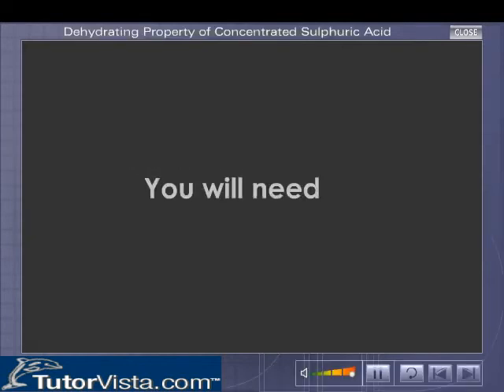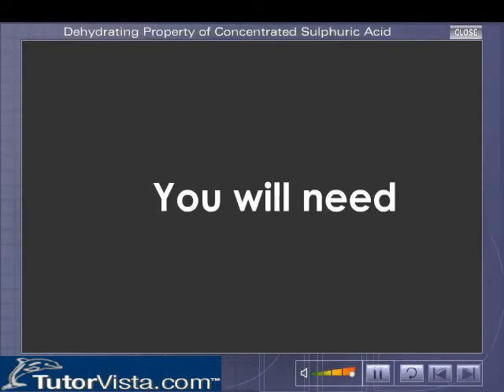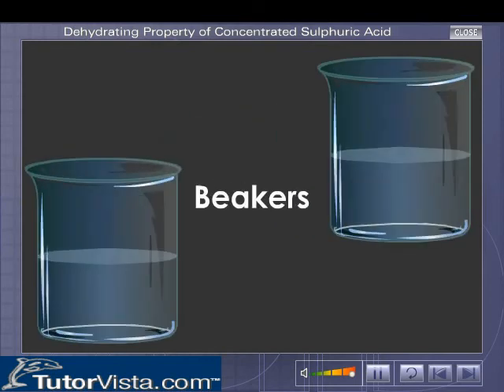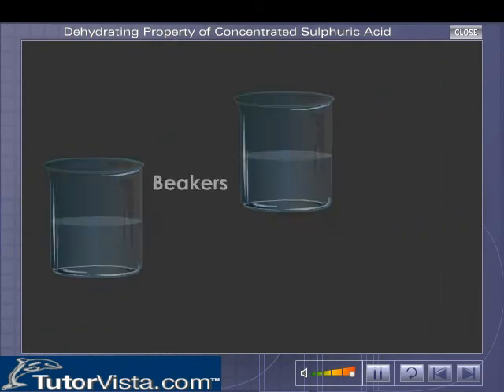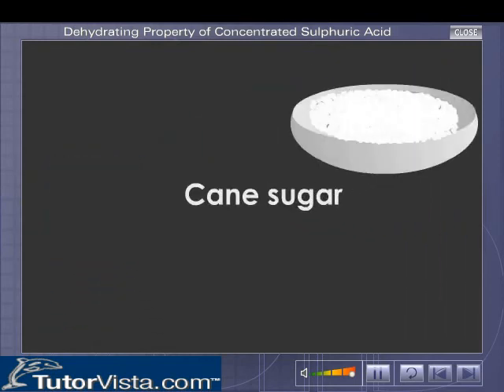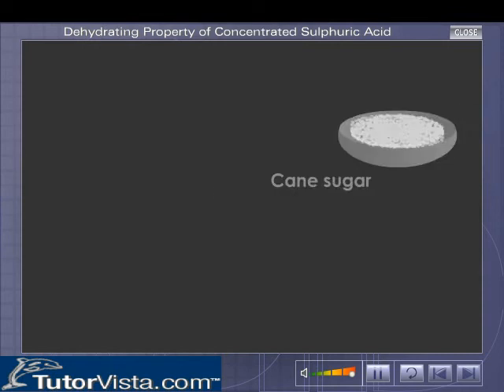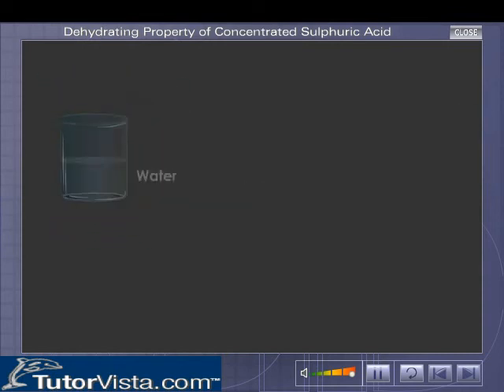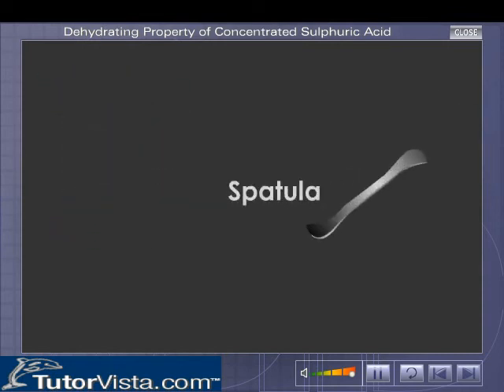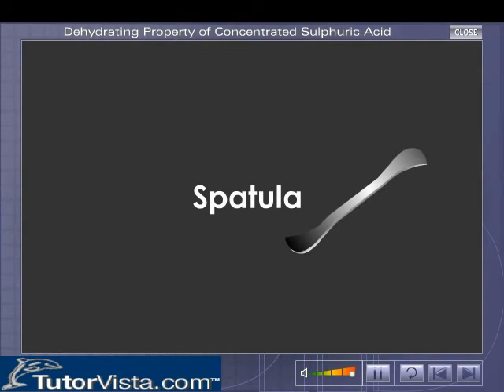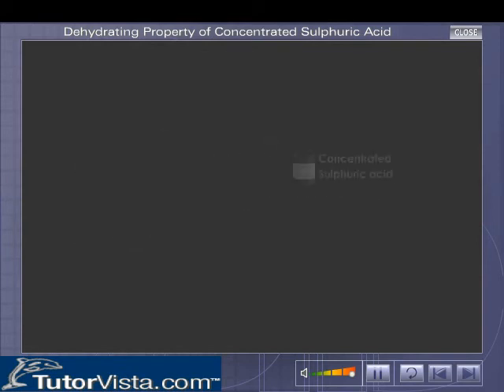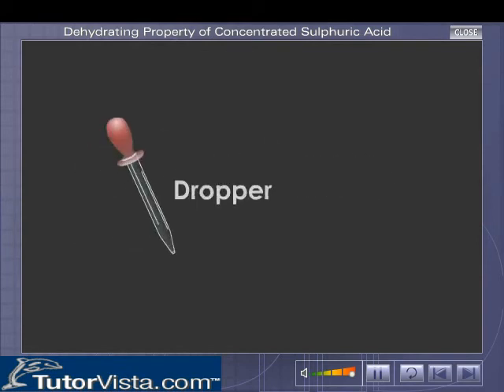For this experiment, you will need beakers, cane sugar, water, a spatula, concentrated sulfuric acid, and droppers.